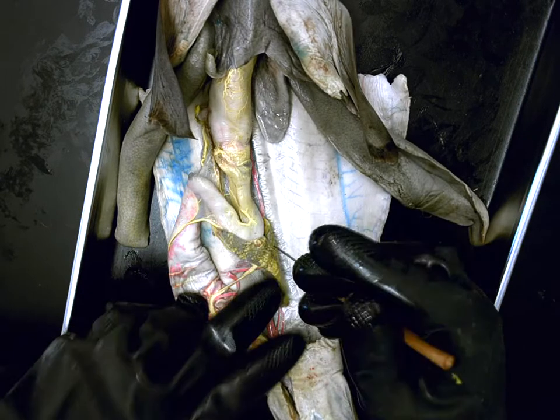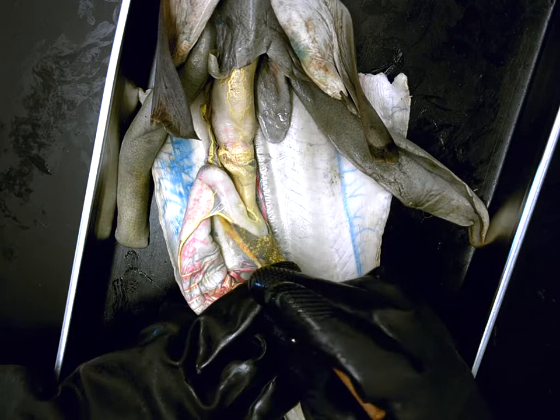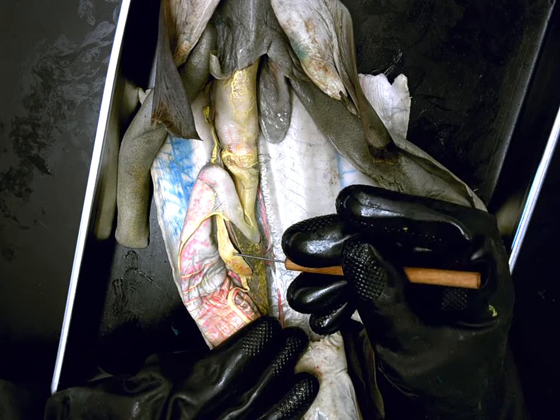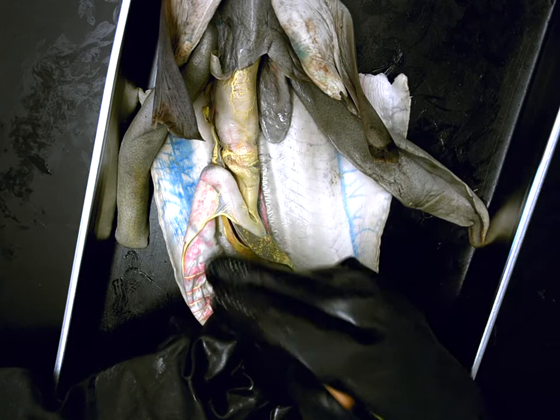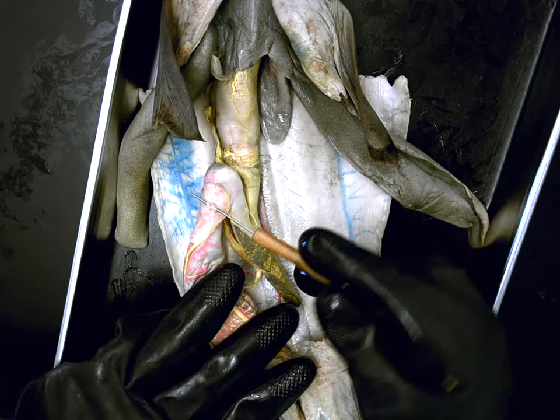So again, we have J-shaped stomach with spleen. Then we have curving here to the flat pancreas, but in between there's a long lobe of pancreas again. Exactly. So again, the pancreas has how many lobes? Two. One is a long lobe, one is a round flat lobe. Okay. Both are pancreas. Give me, Ashkin, one function of the pancreas.